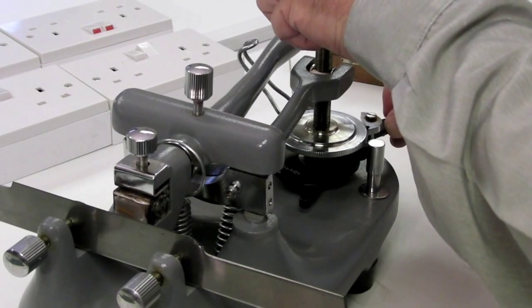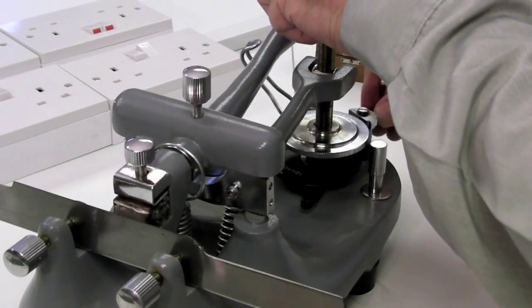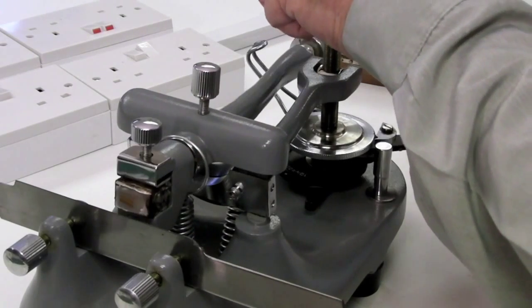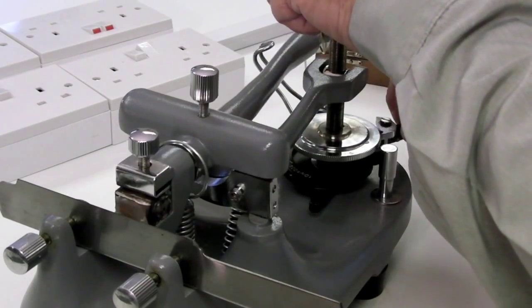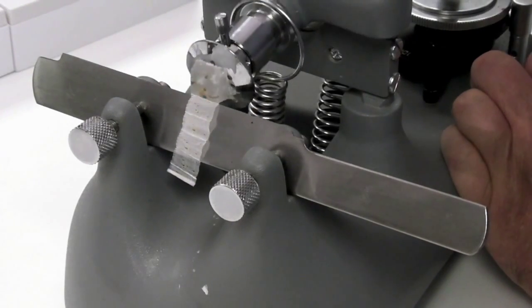Each cutting stroke should cover the entire surface of the block. To rough trim the block, the lead screw can be advanced manually to make sure that the wax block moves forward in relatively large amounts, once the whole surface of the block is being cut. Then sectioning can commence.